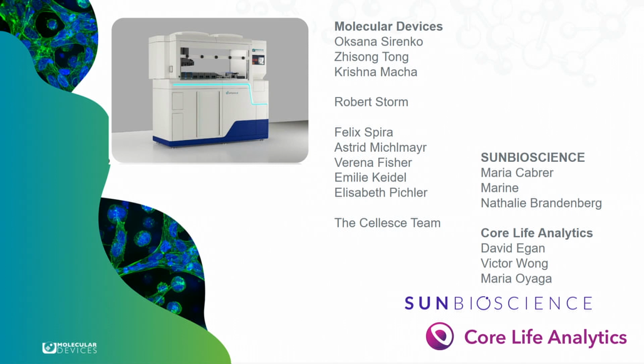Yeah, and say you would want to retrieve the sample, is that something that you envision as well, eventually to be able to have a workflow that allows you to get them out again? Yeah, definitely. I mean, we do have some of that implemented already with the matrigel-embedded organoids, iPSC too, by retrieving the cells. So those are retrieval for the next step, but we can also retrieve them for other purposes too, right? Yeah. Mm-hmm.